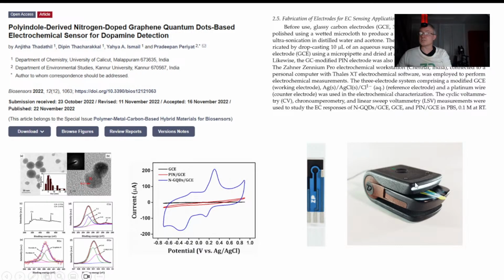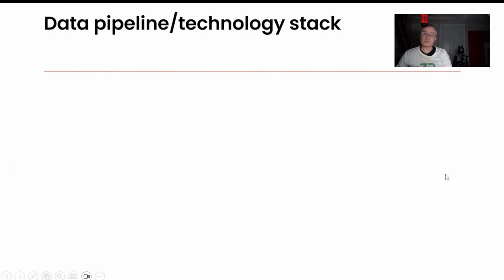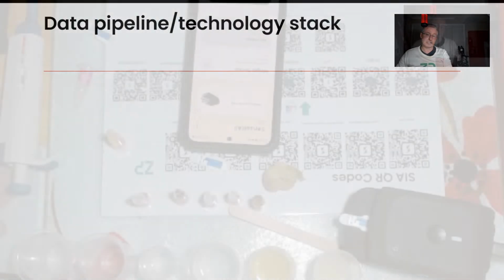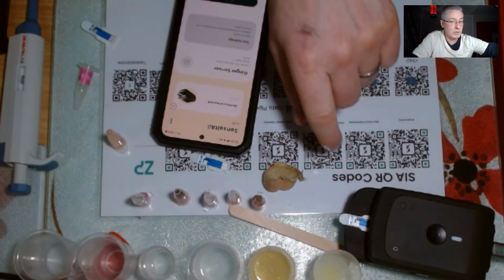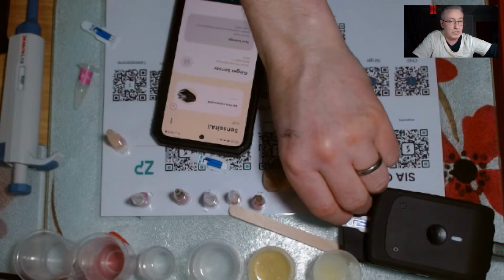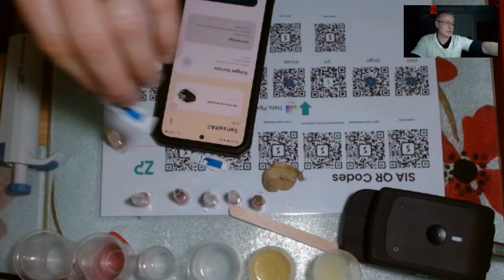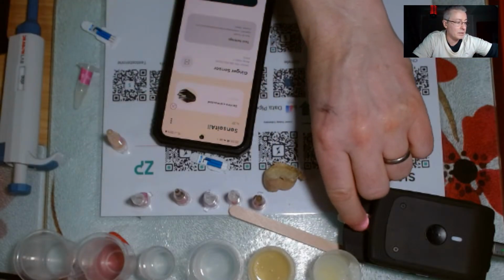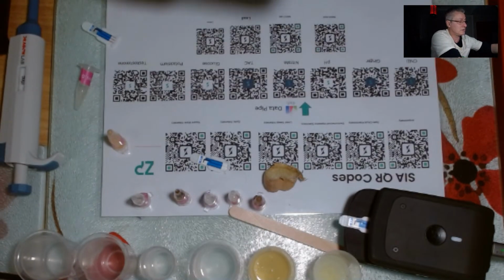I would definitely be using these screen printed electrodes. Now what I'll do is a quick demonstration, but a slightly different demonstration to earlier on. I've got a new sensor in there rather. In fact, I want to put what I call a chili sensor into there. So let me get one of those and put that in there like that. I'm just going to scan this.